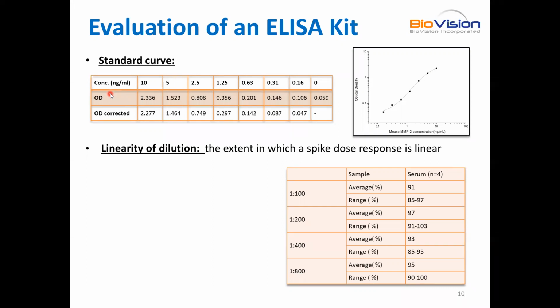We should also look for the linear range, and this will help us to calculate the actual concentration of our sample.